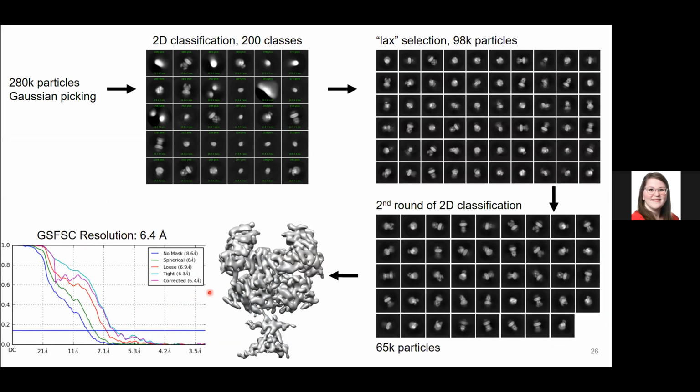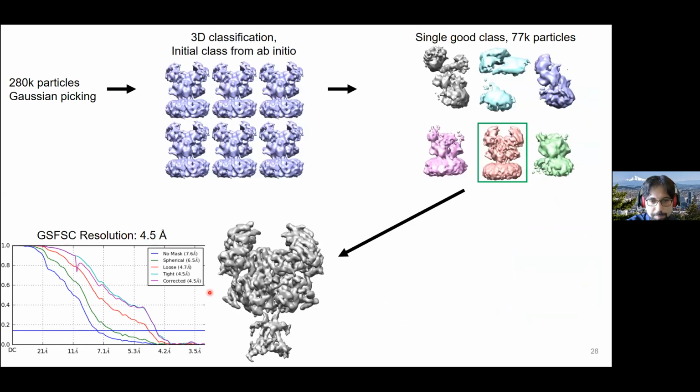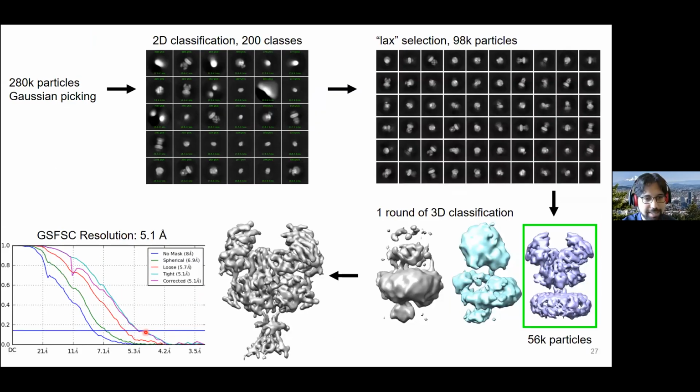A little more clarification for this question: they're referring to the linear looking curves, at 5.1 resolution. Okay, so kind of at the edge here.